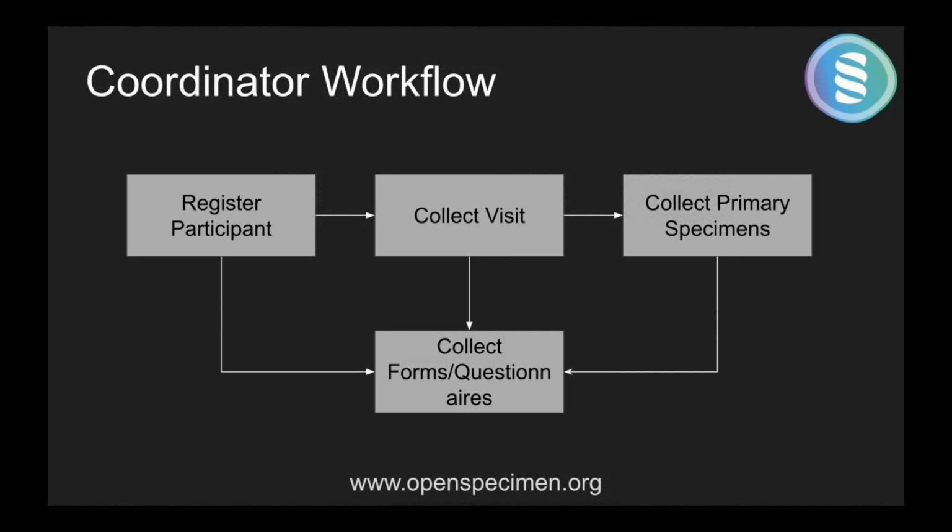You might also have staff who are just registering the participant and collecting consent, standing in front of the patients, and this could be broken down into smaller roles too. But this is the workflow we focused on in this feature, where they can go until collecting primary specimens and then be done, so they're not bothered about aliquots, storage locations, and so on.